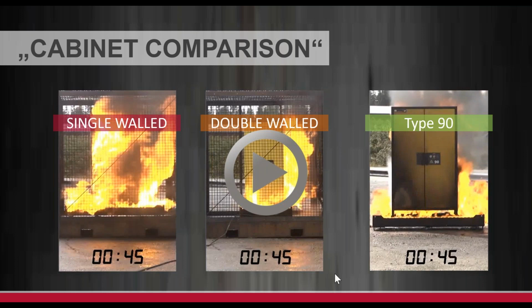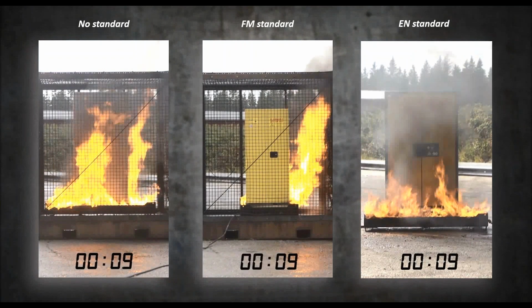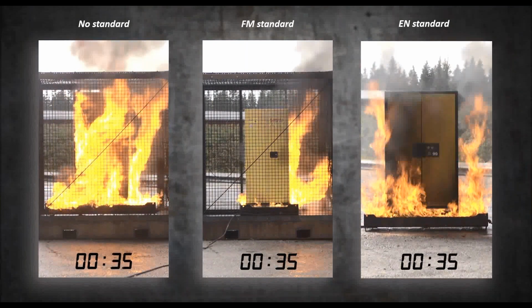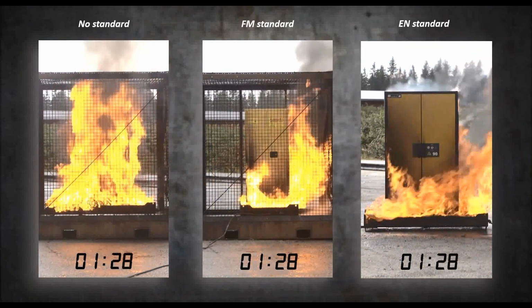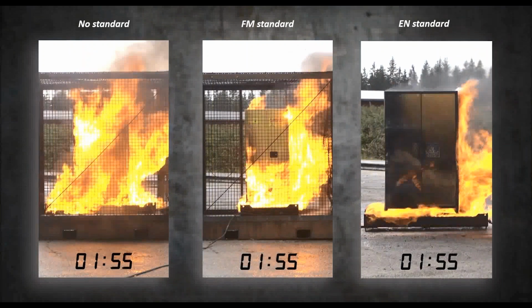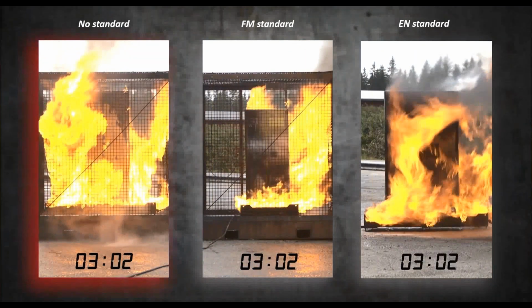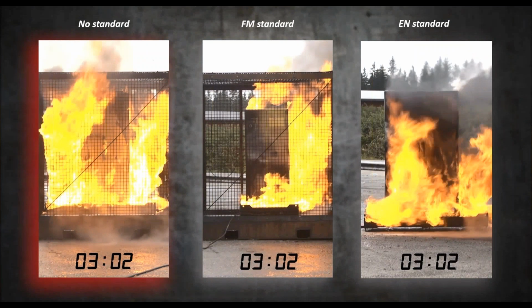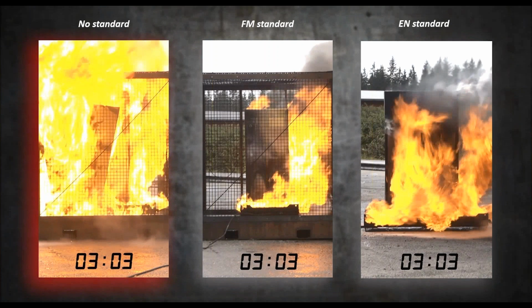So let's watch this video together. The one on the left is that single-walled cabinet, no registration, no approval from any codes or anything like that. So it gives you about 3 minutes of fire resistance, right?